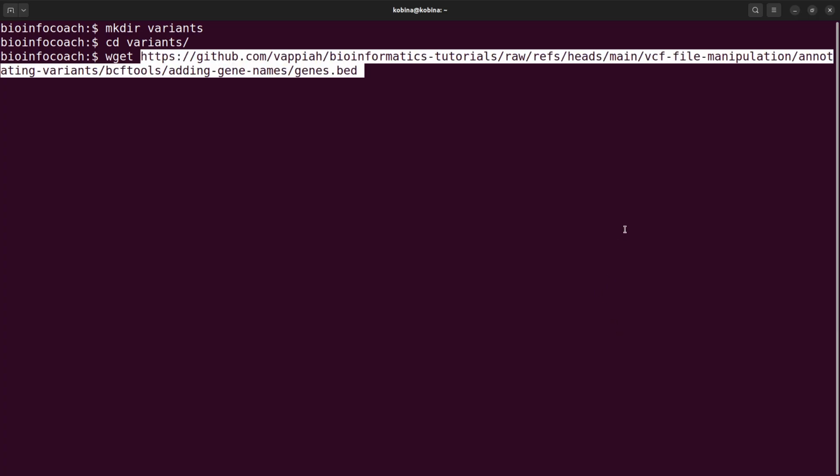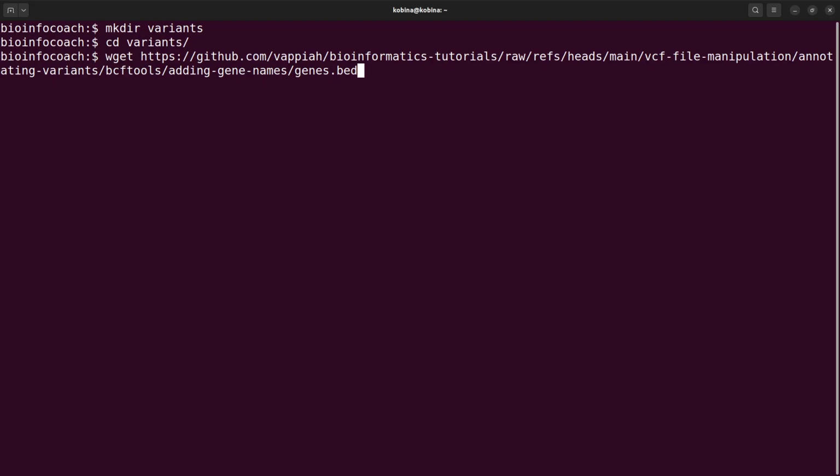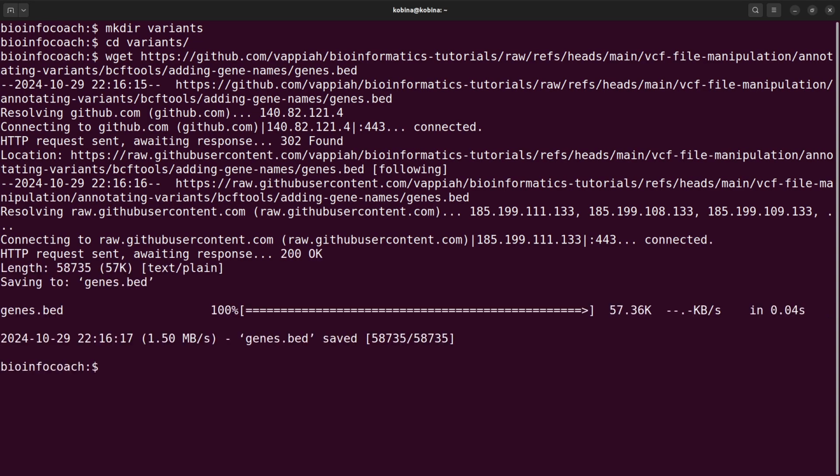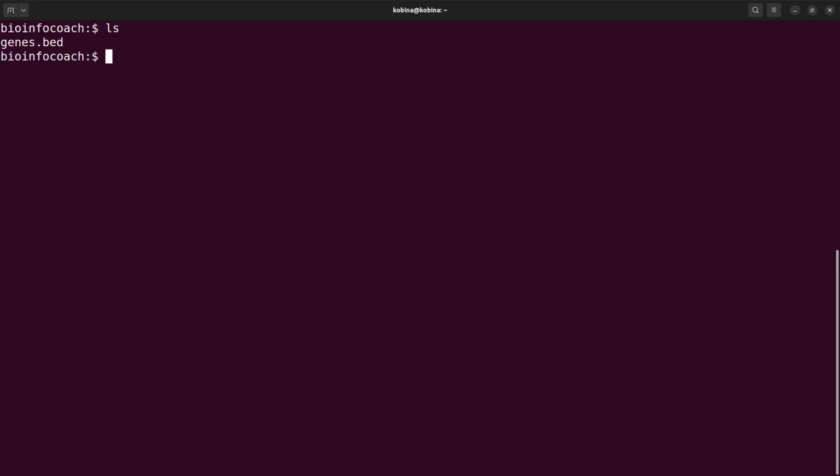There's the link. All right, and then I'll run it. When I run it, it's a small file, so it's going to download quickly. I have it downloaded, so I will just clear the screen. I will do an ls, and I'm going to find the bed file here. We will talk about the bed file later.